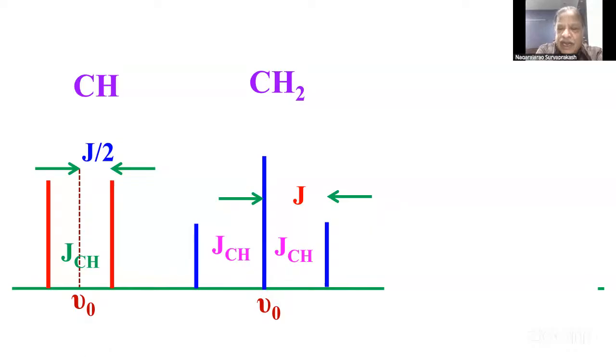This is also, in NMR jargon, we say this peak will always be on resonance. In the sense, it will be fixed to a particular axis when you bring it in. This vector will not move at all. Only these two vectors start moving. Again, one moves faster, one moves slower. But can you see the difference here?